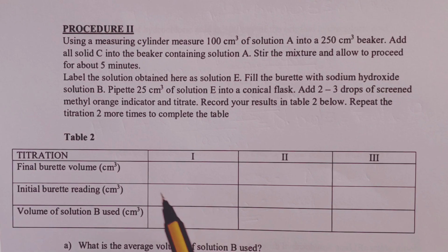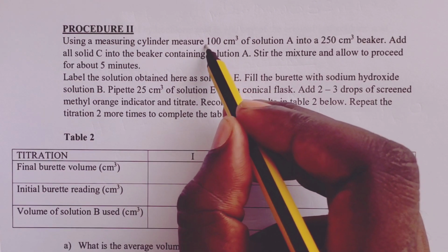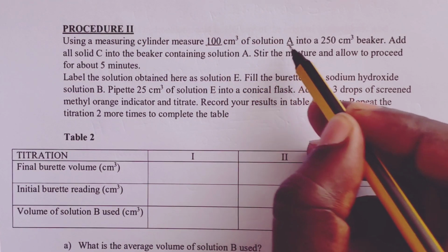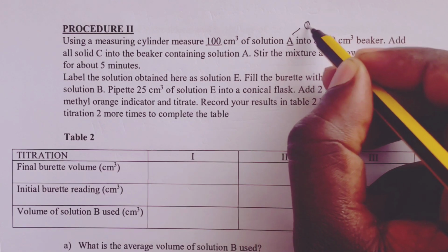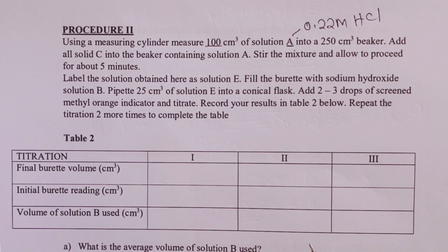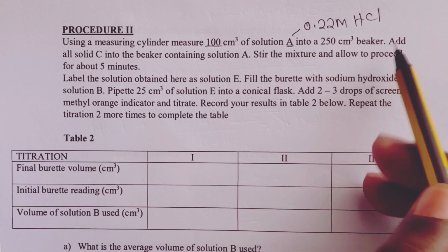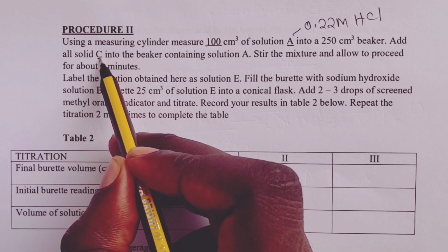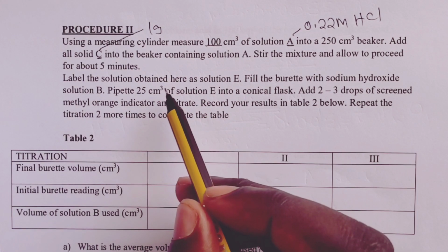In procedure 2, we are told to use a measuring cylinder to measure 100 cubic centimeters of solution A. Solution A, we have just found to be a 0.22 molar hydrochloric acid. This summary is very important for a candidate who wants to really have an easy time with the calculations. So we will do that into a beaker. Then we add solid C, which was 1 gram.